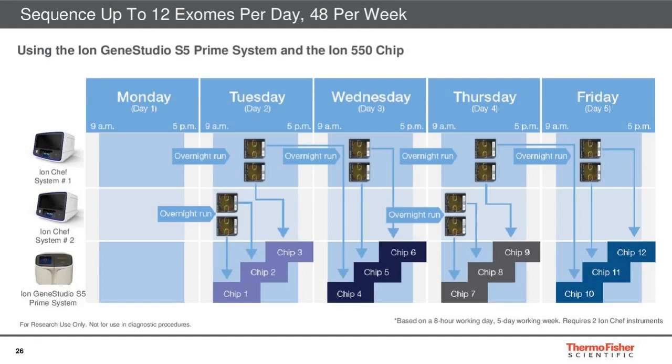maximum workflow efficiency. So I know that this slide is a little bit busy, so I'll run you through a quick example. If you prepared 16 exome libraries on Monday, you could template 12 samples across 3 550 chips on Tuesday and sequence overnight. The remaining 4 samples would go on a 4th chip that could be templated overnight on Tuesday and then sequenced during the day. And then the process would continue as shown on the slide, enabling you to sequence 12 550 chips a week with 8 or 12 exomes sequenced per day.